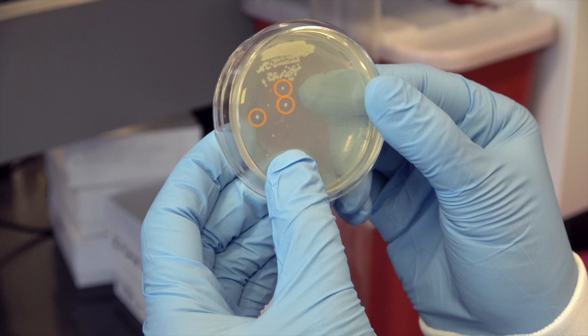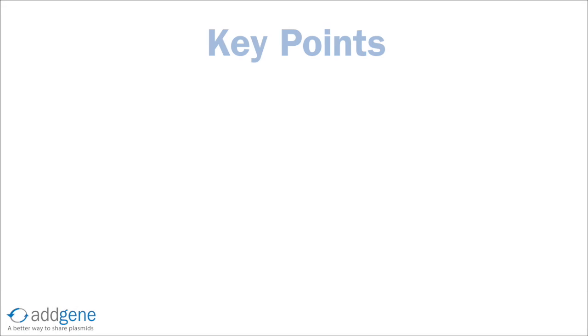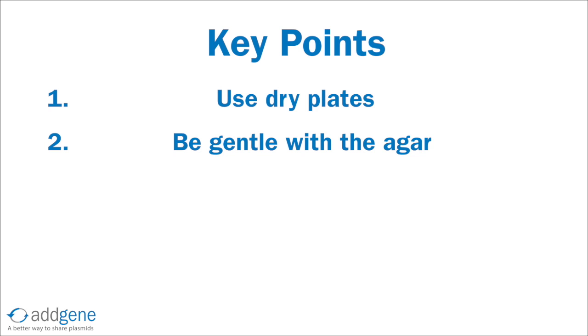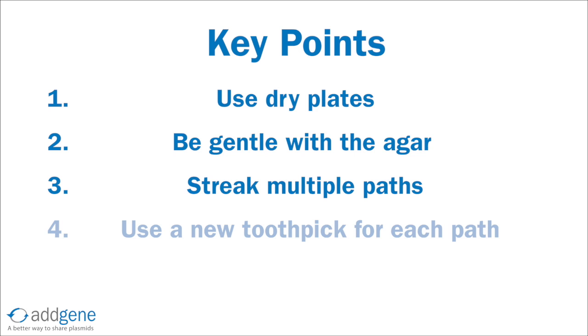For optimal bacterial streaks with single colonies, always remember these key points. Use dry plates. Be gentle with the agar. Streak multiple paths. Use a new toothpick or sterilize your loop so that each path is fresh. And perform all work near a flame.